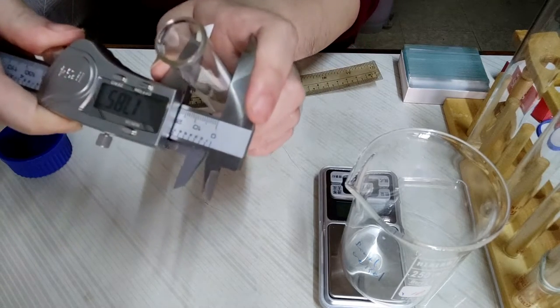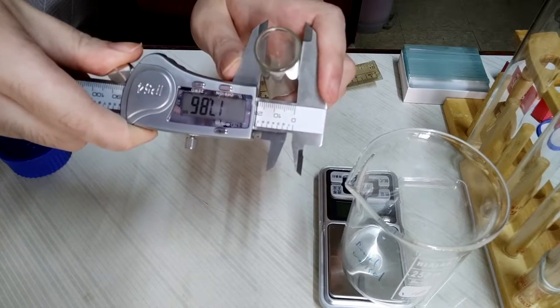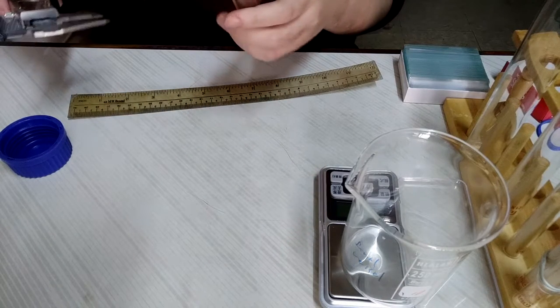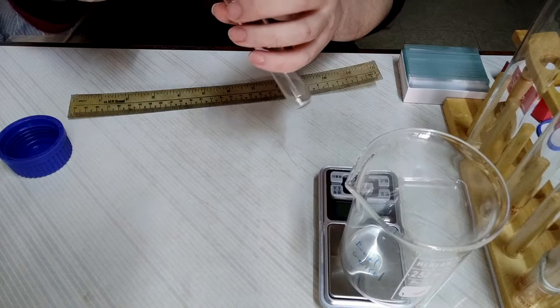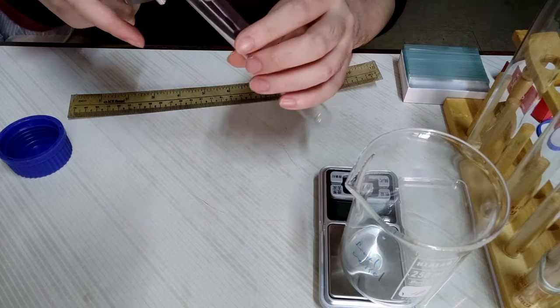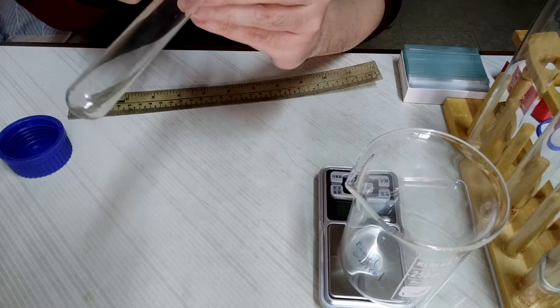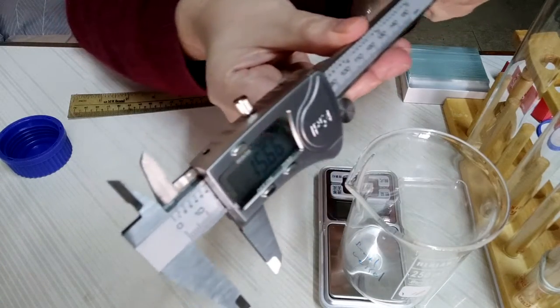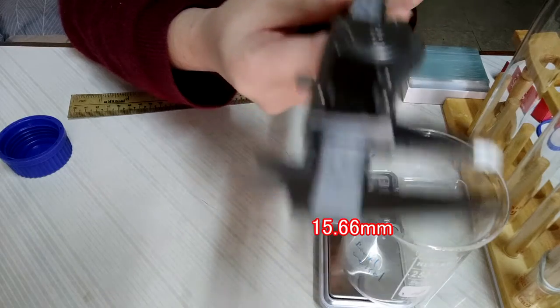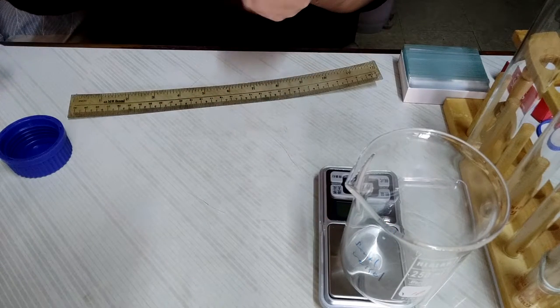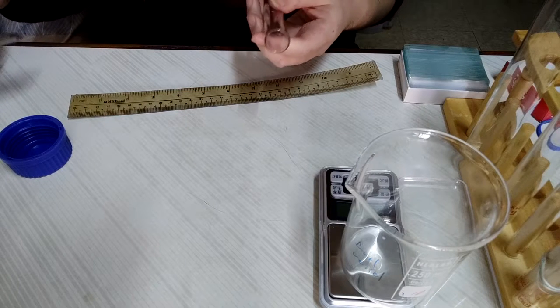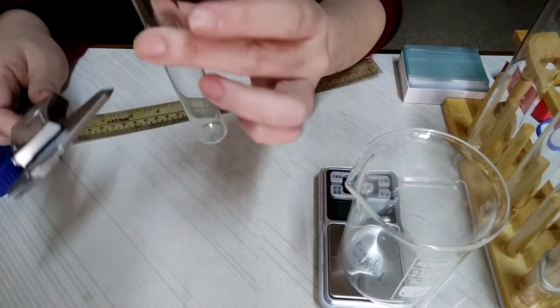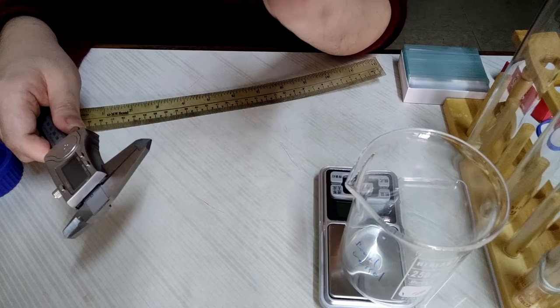The diameter is around 18 millimeters, and the internal diameter is around 15 millimeters. So if you have broken some test tube from your school and you want to buy a replacement, find some test tube that has a similar dimension.